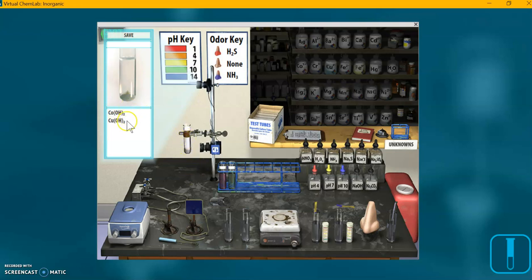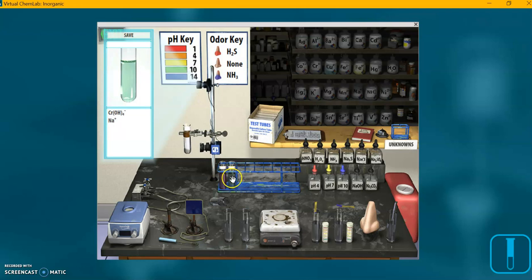Over here on screen we still have our two insoluble precipitates — cobalt and copper hydroxides. If I mouse over the decanted tube, it changes the screen. We can see we've got the complex chromium ion, as well as the bystander sodium ion, in a nice clear greenish solution. That is the test for chromium — the clear green color.